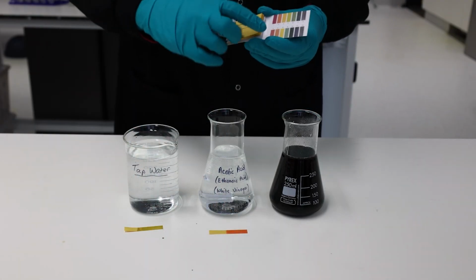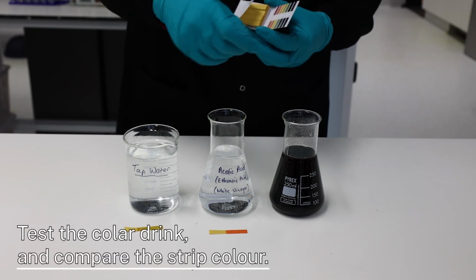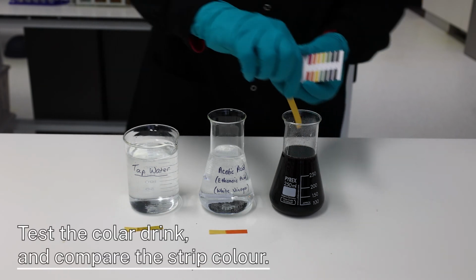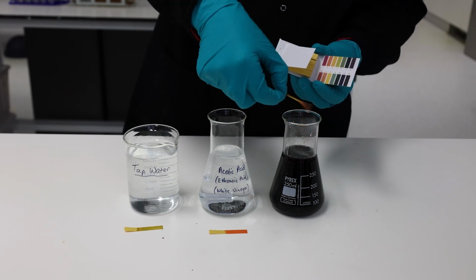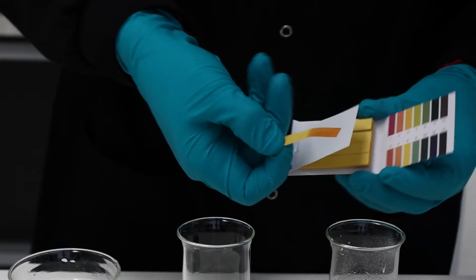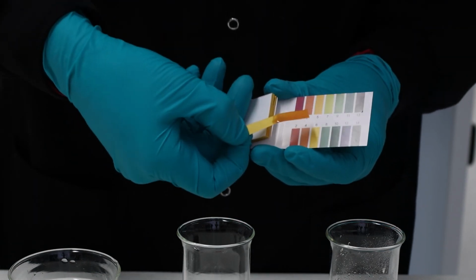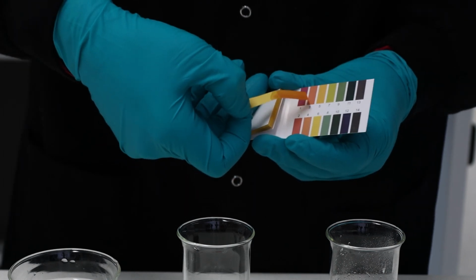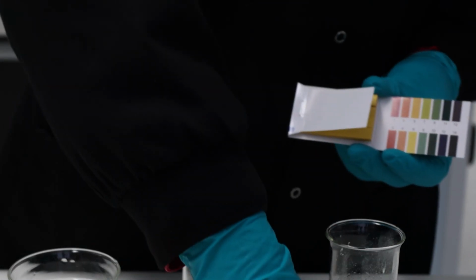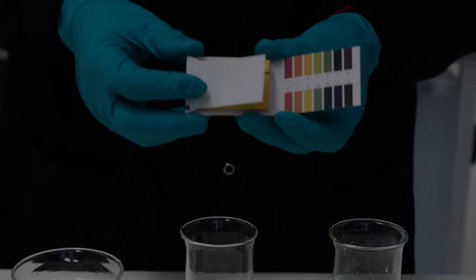And finally, let's measure the pH of this cola. So Coca-Cola is a very common beverage, but it's also a very acidic beverage. So again, we get quite an acidic colour. When we compare it to our chart, we get about a 3. So the cola here has a very similar pH to the vinegar.